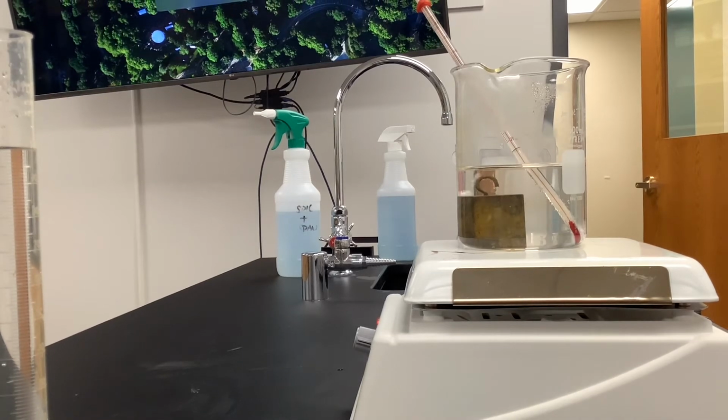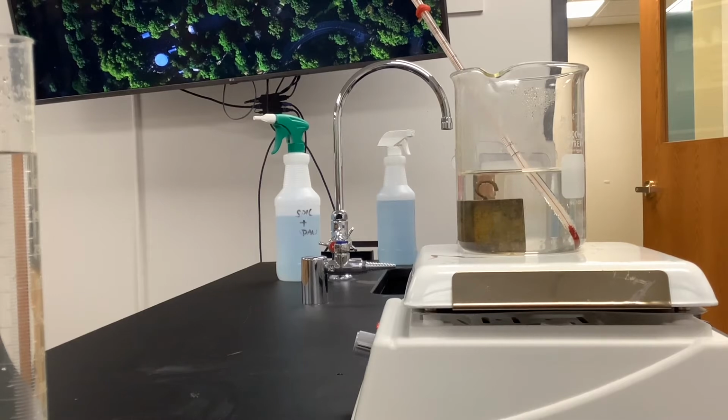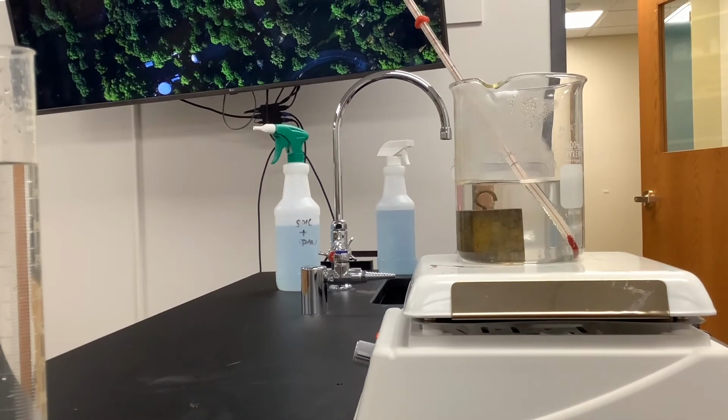As I collect the data, you follow along, record those numbers in your data table, and then use those numbers to do the math, find the specific heat of that metal, and use it to identify that metal.